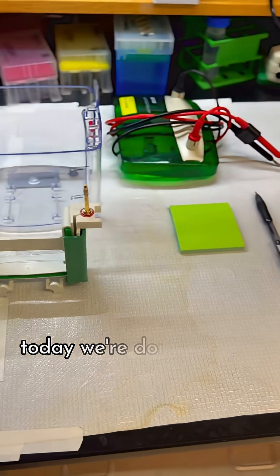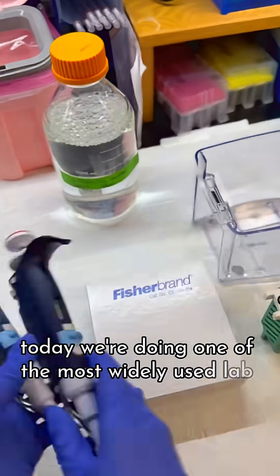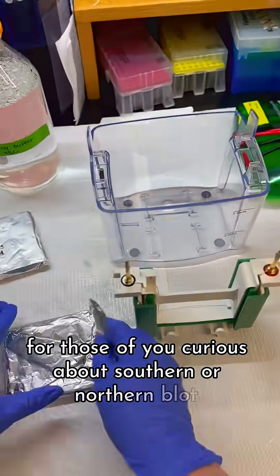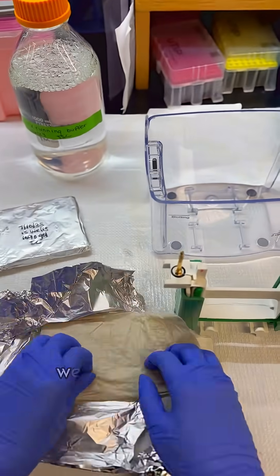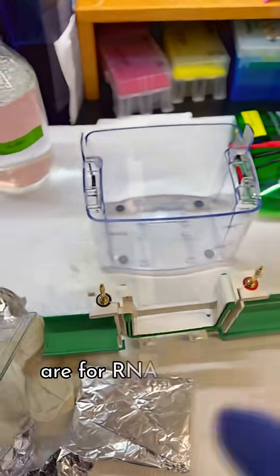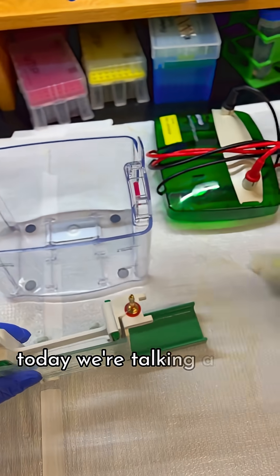Welcome back to the lab. Today we are doing one of the most widely used lab techniques: western blot. For those of you curious about southern or northern blots, we have those too. Western blots are specific for proteins, while southern blots are for DNA and northern blots are for RNA samples. Today we're talking about protein.